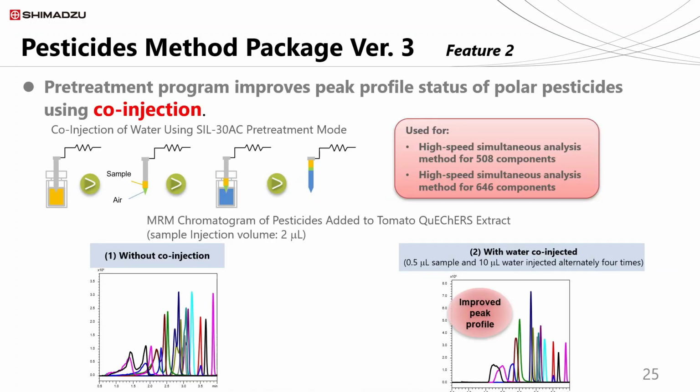This is really a very good example for the food safety sector. In pesticide analysis, samples are typically extracted by the QuEChERS technique, where samples are diluted in 100% acetonitrile in the last stage. When we inject such a sample, the early eluting peaks show fronting. This is mainly because of the polarity difference between the mobile phase and the sample diluent. To avoid that, some laboratories evaporate acetonitrile and reconstitute the sample with a mobile phase composition.